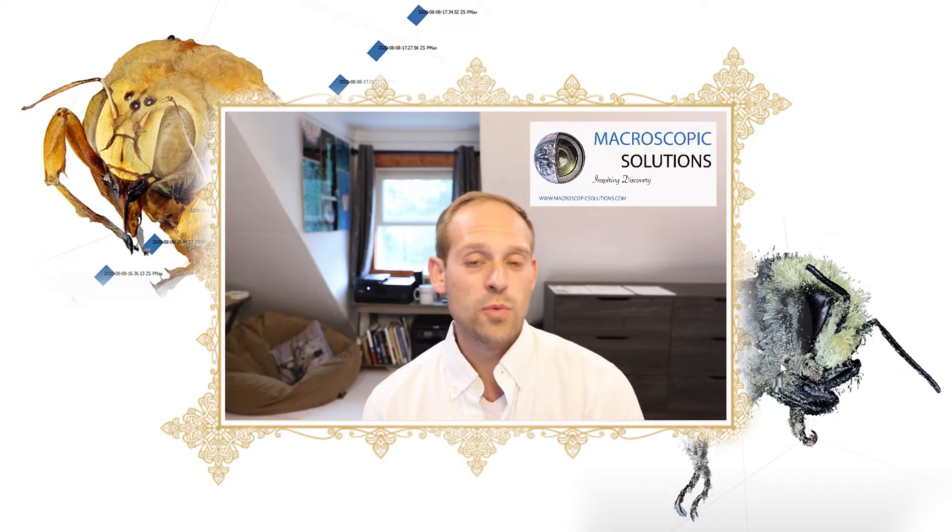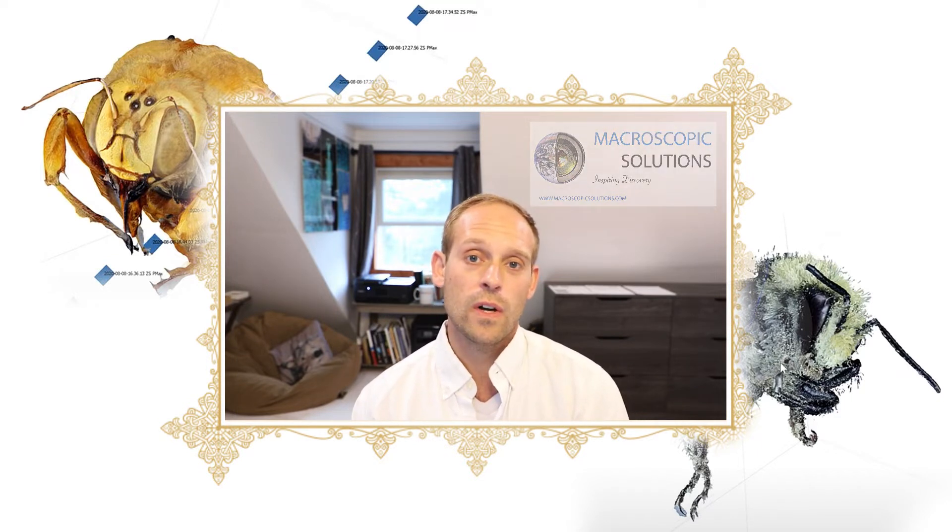Are you looking to get started with photogrammetry? Do you need to use focus stacking when you build your 3D models? What kind of cameras do you need to use? I'm Mark Smith with Macroscopic Solutions, and this will be a guided short course on how to focus stack and 3D model small-size scientific specimens with the intent of building a 3D model.